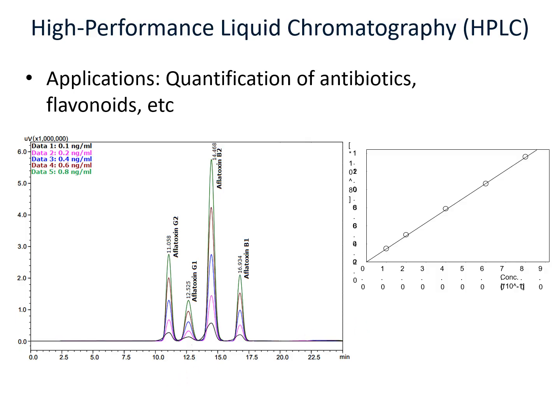In addition, HPLC also requires validation, just like thin layer chromatography, to determine the linearity, limit of detection, limit of quantitation, precision, accuracy, and so on before it can be adopted for analysis of unknown compounds.